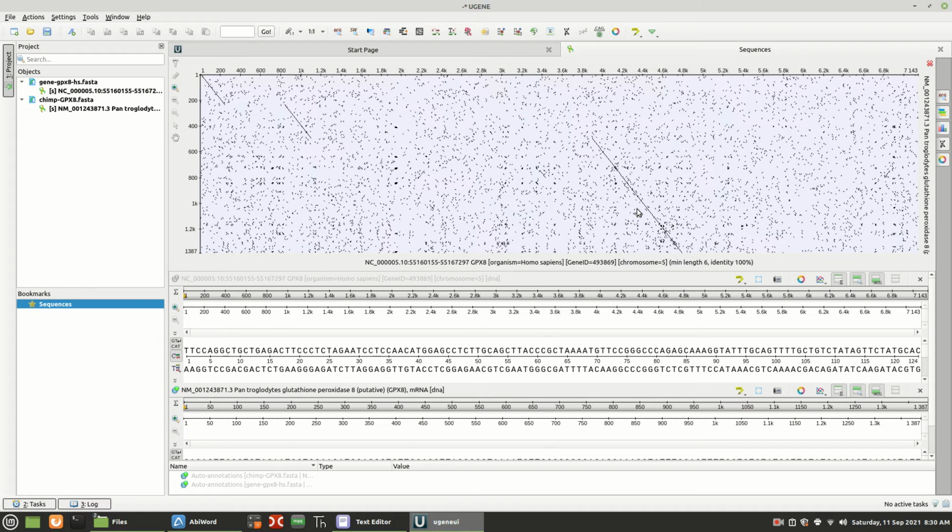So now the question is, what can we learn? Well, we need to learn about these and see how similar they are. Now that would be back in your BLAST results. Your BLAST results would give you these 3 all aligned. So you might go back and do a BLAST now. This is a visual one, and so visually you can see this. Now your BLAST results, what BLAST gave you at the bottom where it does the alignment. So if you do a BLAST, and when we receive that and we scroll down to the bottom, it would have given you an alignment.